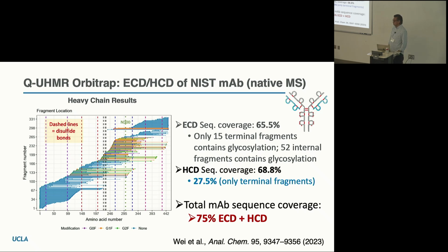Yes. Is there any limitation to what kind of interactions these methods may miss? Yeah, so the question is, are there any limitations to the type of interactions that native mass spectrometry wouldn't address? For the longest time, I thought that hydrophobic interactions would be completely transparent because hydrophobic interactions require water. And I'm putting this protein in the gas phase with no water. So I've evaporated all the water. And so how does a lipid bind to a protein? Usually it's through the tails that form hydrophobic interactions to some parts of the residue. And if the water's missing, then how is that even stable?